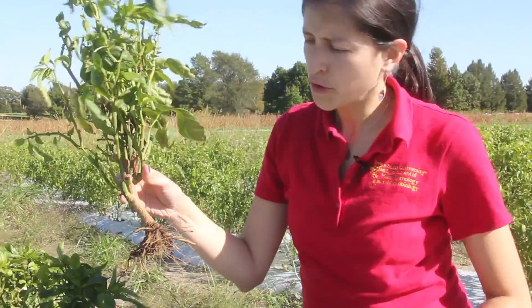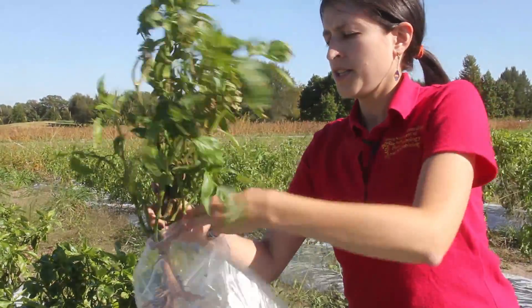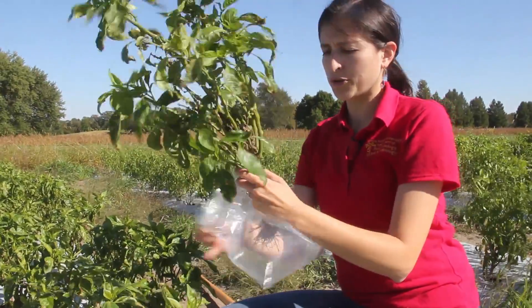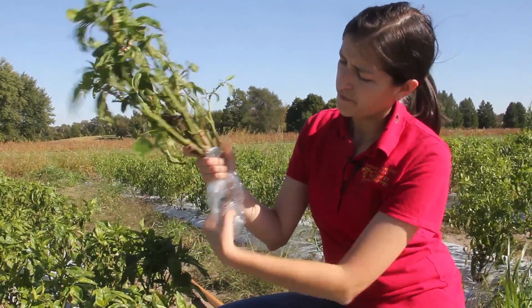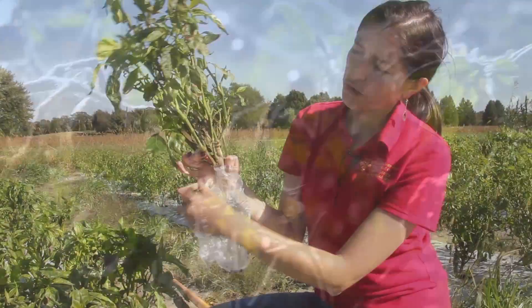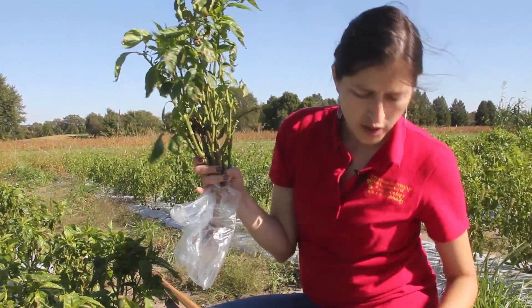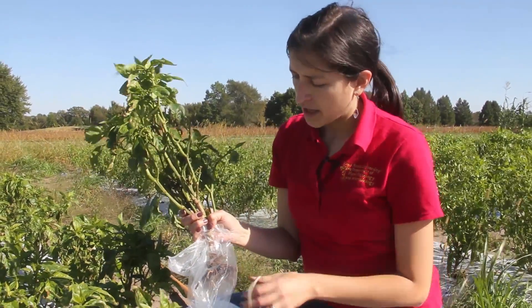Then you want to make sure that you keep any soil particles that remain lodged in the roots. At this point you can either use your zip-tuck bag or a rubber band to go around and secure it.